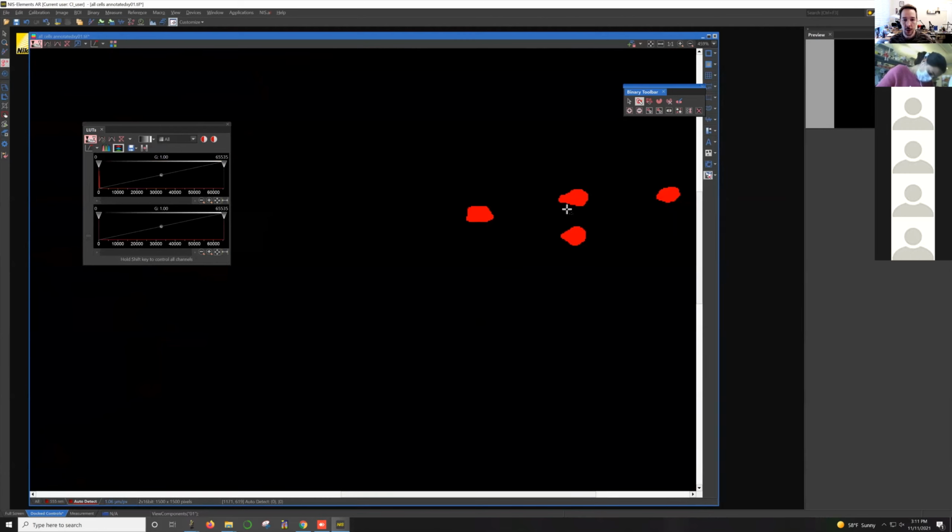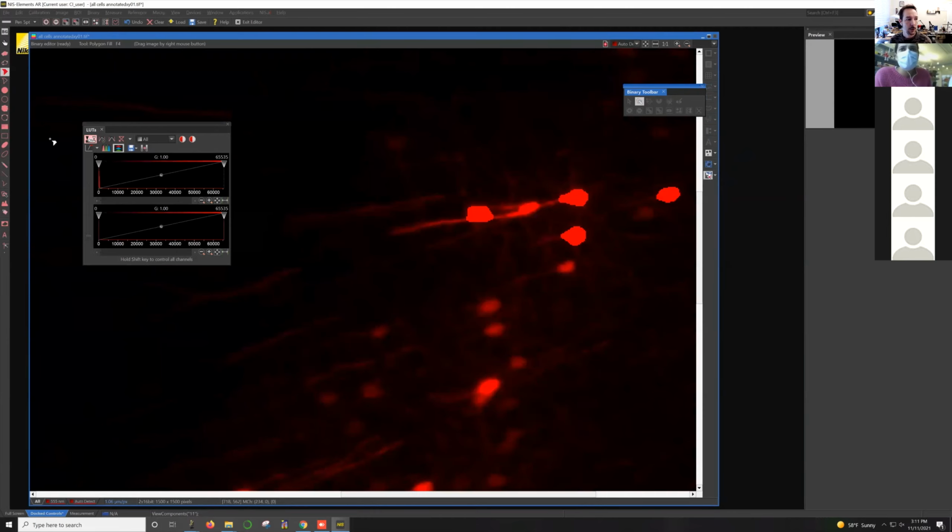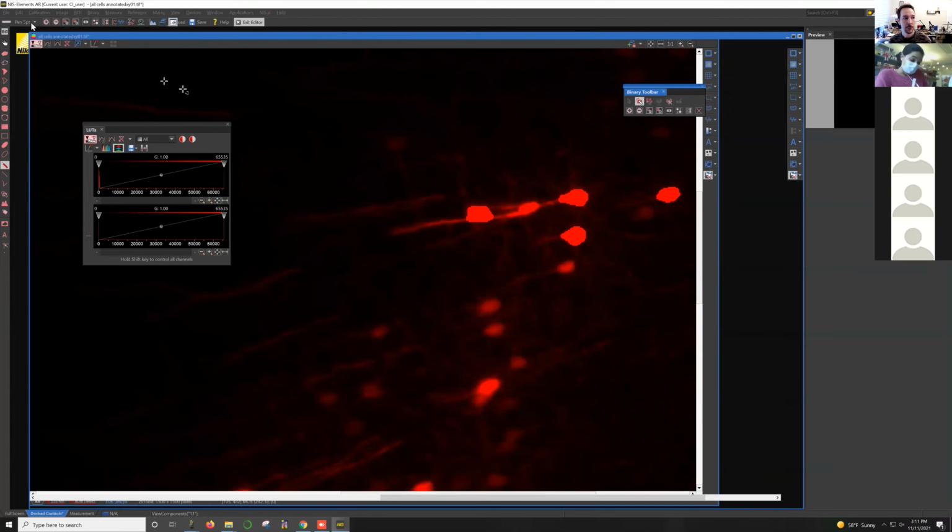So very quickly, you can have a bunch of cells. Maybe you do some automatic detection, fix it up with this very quick selection tool to get the rest of the cells. And also, just while we're here, if you press tab, you have this painting tool. If you find that some of these cells are not quite accurate, you can use these paint brushes to paint background. So you can very quickly fix up a few pixels that are inaccurate. And then you can just export these as TIFFs.